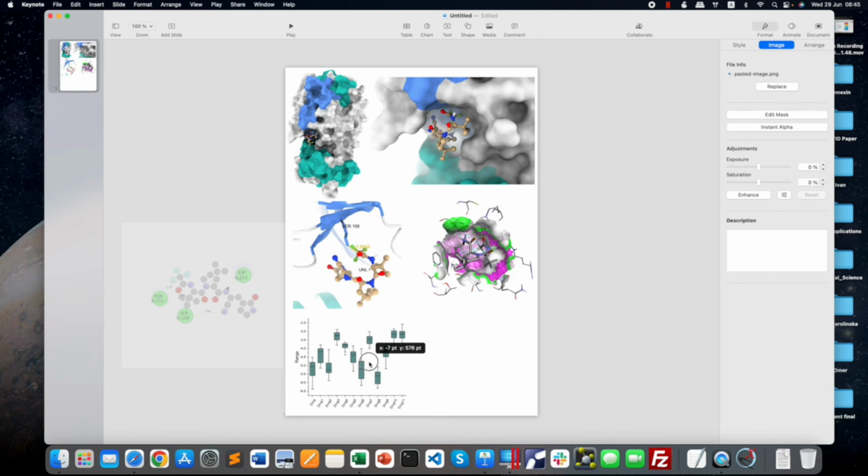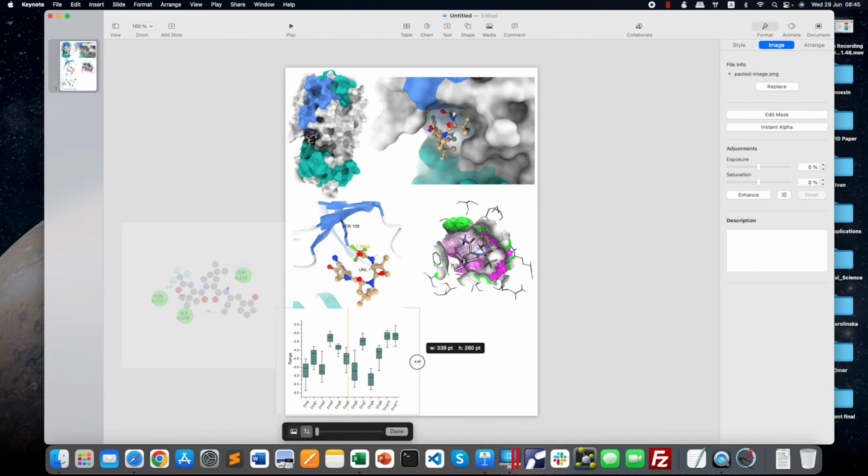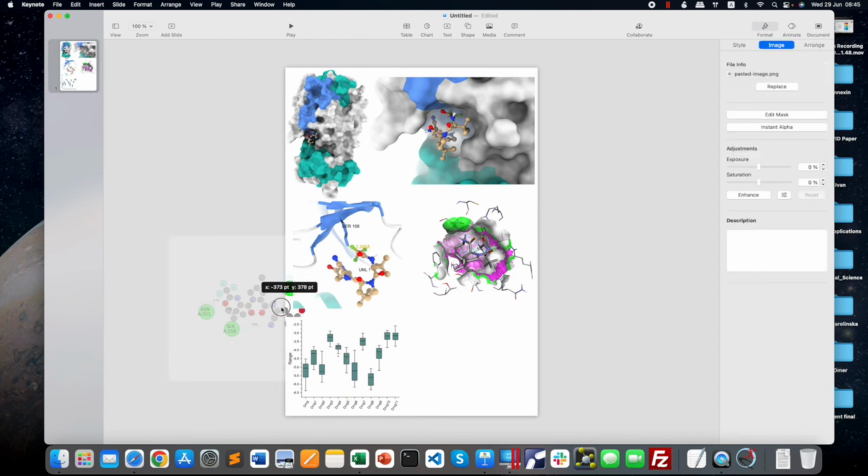So this is another view. Now you have your 2D plot, and you can also do the same by removing the white spaces from here, and at last you have your 2D plot.